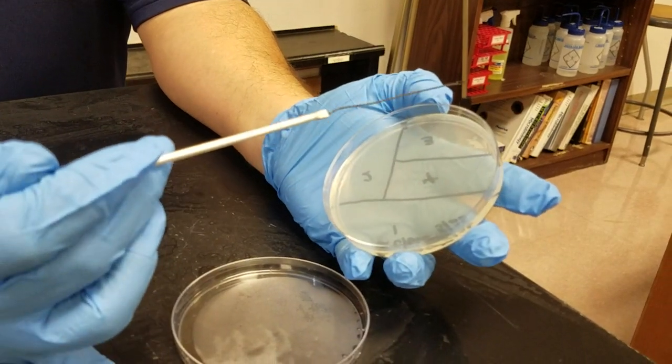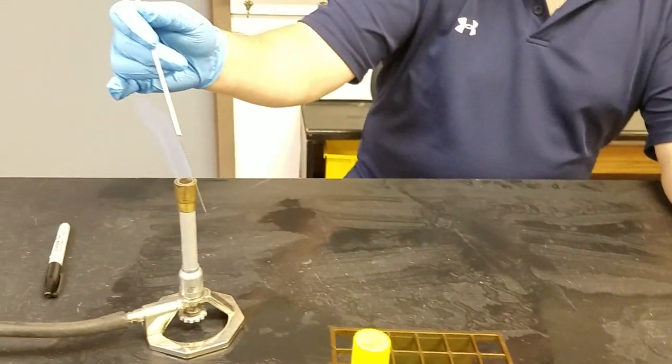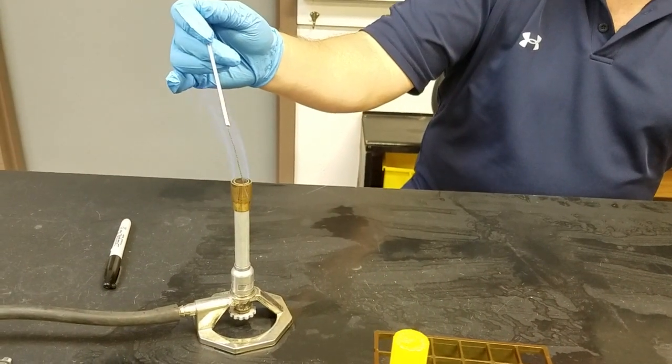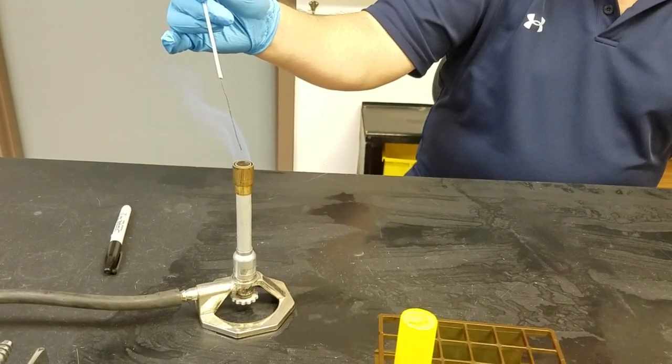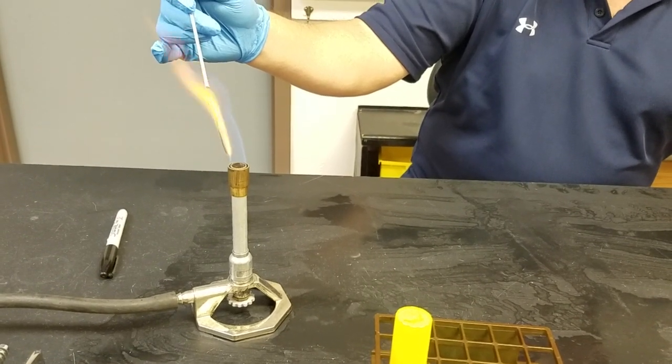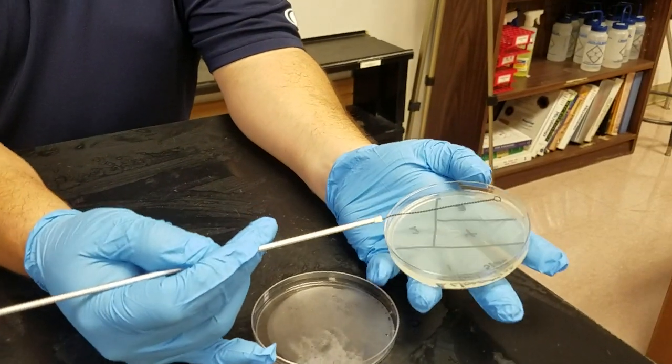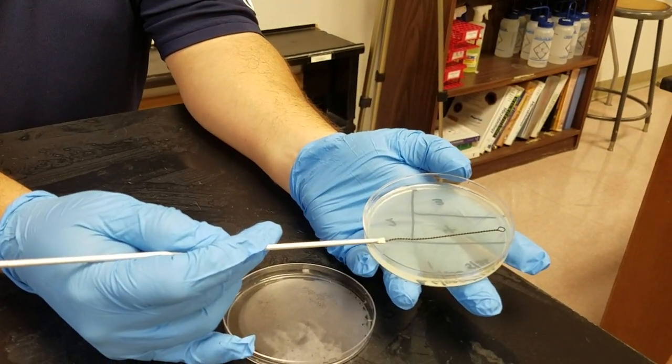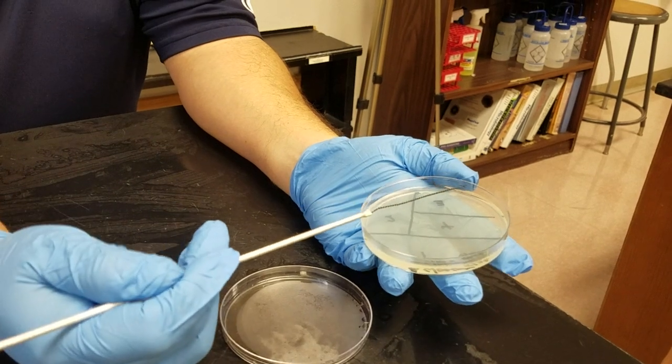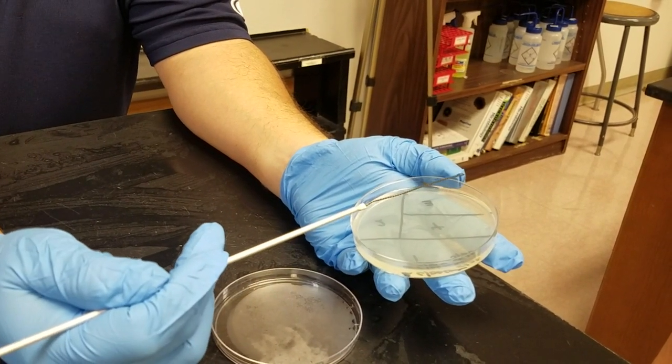I'm going to be interested in that last quarter of the third quadrant, but before I do that, I want to flame the loop one last time. Nice and orange, really hot. Come back to the plate and touch it to the area of the fourth quadrant I'm not going to use.